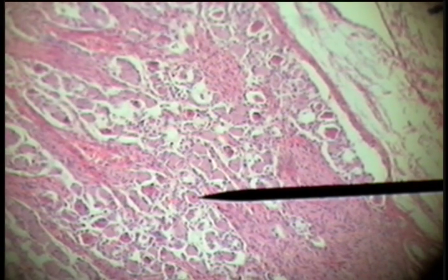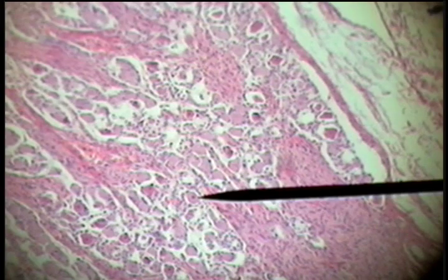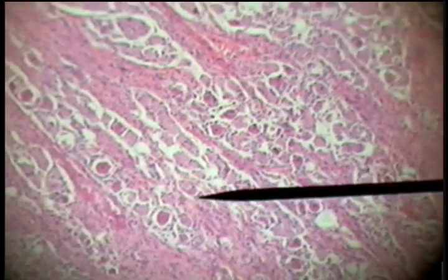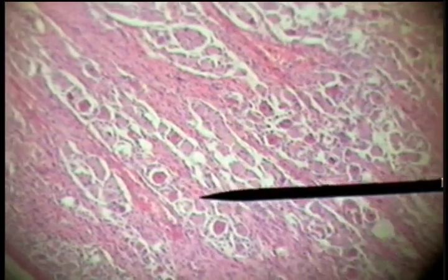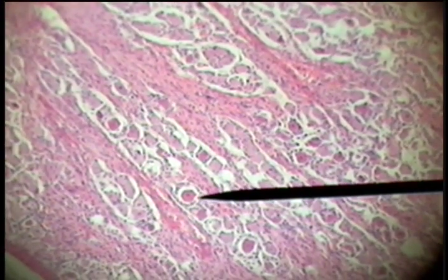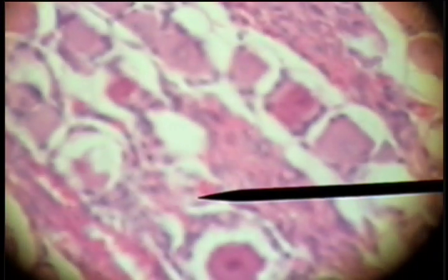The owl eye cells have dark nuclei in the center, cytoplasm, and they're spherical. You can't see the processes, so they appear as circular structures with a dot in the center — owl eye neurons. This would be the nerve cell body.